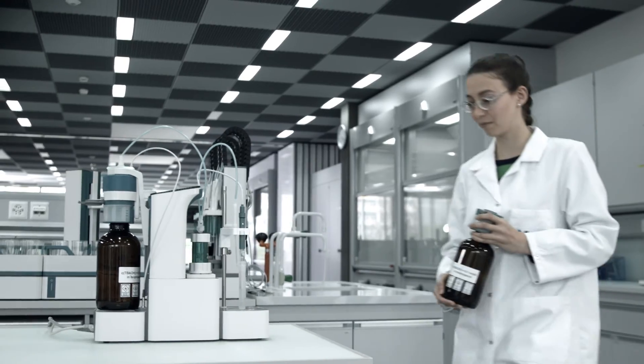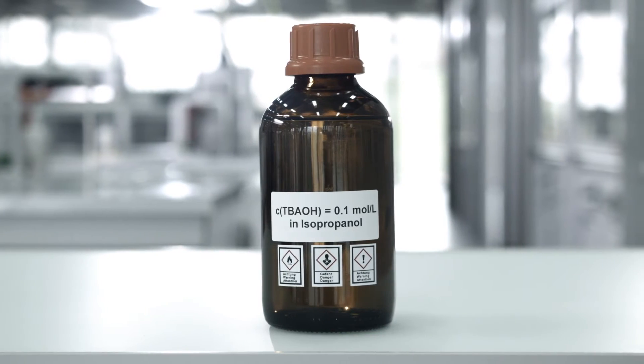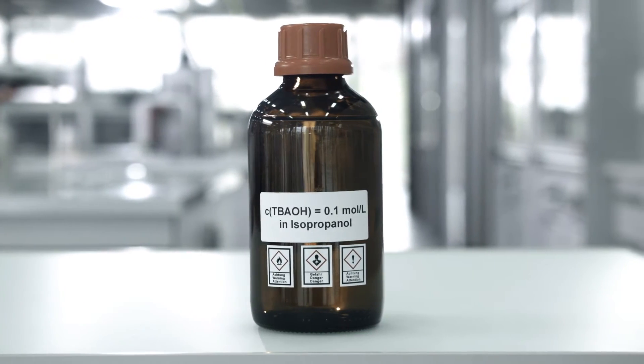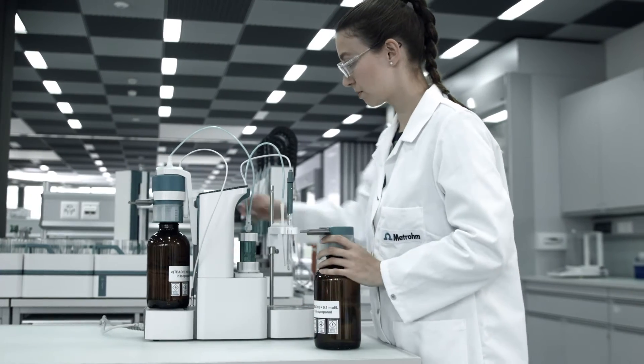Before Omnis, titration sometimes meant exposure to hazardous liquids. Not any longer.